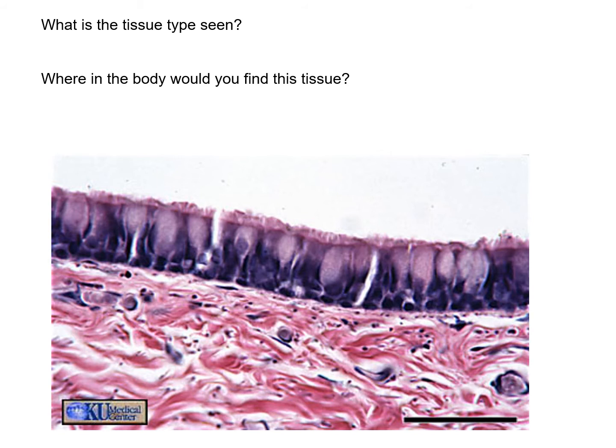Simple columnar. It is not simple columnar. This is the ciliated trachea. Stratified columnar. It's pseudostratified ciliated columnar. You can see the cilia up at the top of the cells, and in between them you have goblet cells. So yes, you could see this in the trachea. You could also see it below the vocal cords of the larynx.